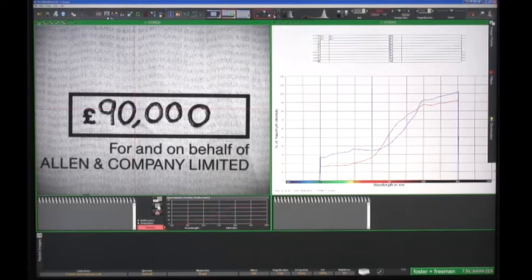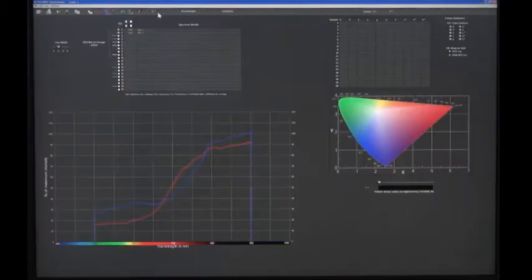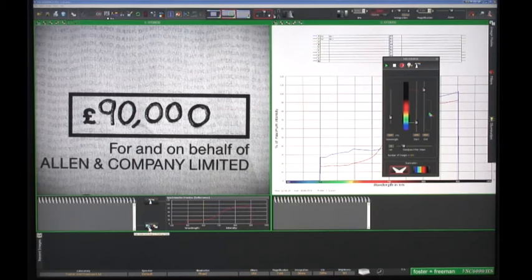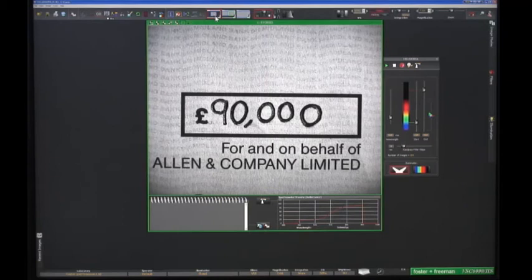You can click this button to go to the spectrometer screen, where the usual array of tools are available. Click this button to return. When you are finished with the spectrometer function, remember to terminate it by clicking the Finished button. The HSI panel returns, and we can go back to the single image mode by clicking here. You may have noticed the little chromaticity diagram image. If you want to plot a point on the chromaticity diagram when using the spectrometer function, you must ensure your recording wavelengths cover the range 400 to 780 nanometers, as indicated by these bracket lines.